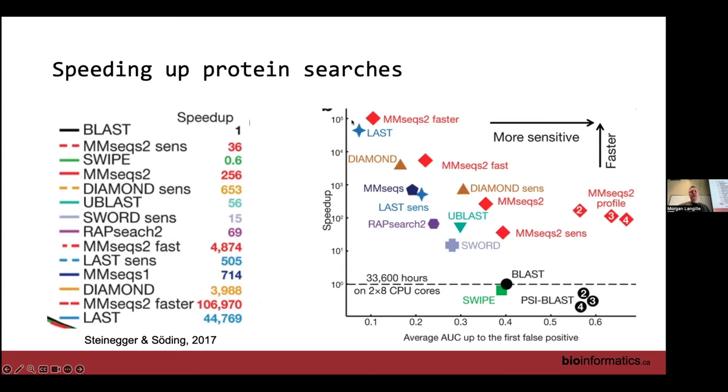Okay, so let's just talk about general functional databases. There's quite a few here, and I'll step through them a little bit. COG is a well-known original classification system. It's still actually used every once in a while, mostly because you can find mappings to COG. People use it because it's sometimes a simple way to classify functions into these COG categories. You can get them to the point where they're fairly general things, and sometimes that's nice for a paper that you're trying to describe.